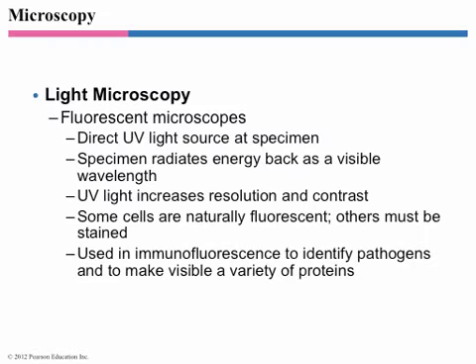So there's also fluorescence microscopy. Fluorescence microscopy is very powerful. What you're going to be looking at is they're going to direct one wavelength of light across the sample. And that wavelength will be filtered out so that it can't get to your eyes. So you're going to shoot it with blue light, but you can't see blue. You can only see red.